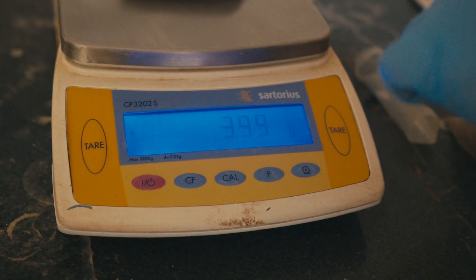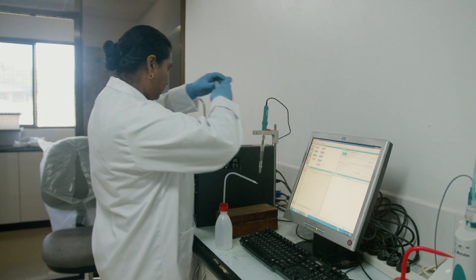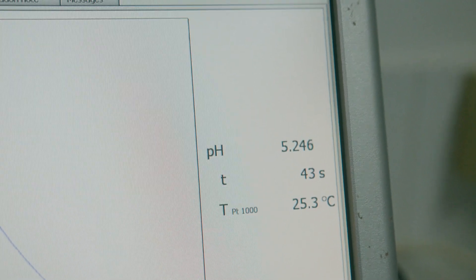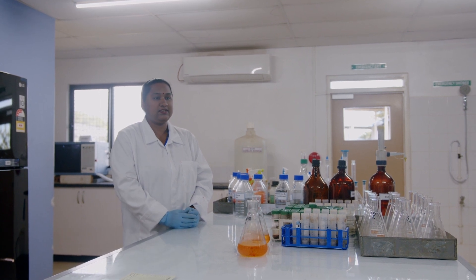We carry out pH analysis, weighing around 4 grams of the sample and taking a reading on the pH meter. We want to know the pH of the soil so that if it is less than 5.5, we can recommend the amount of lime the farmer needs to apply. The purpose of lime recommendation is to bring the soil pH up to 5.5 so that nutrient uptake by the plant is readily available.